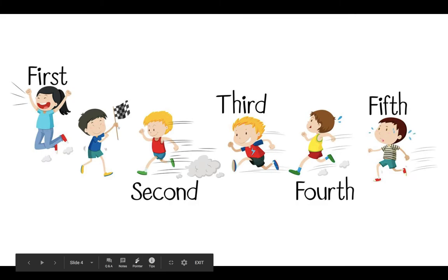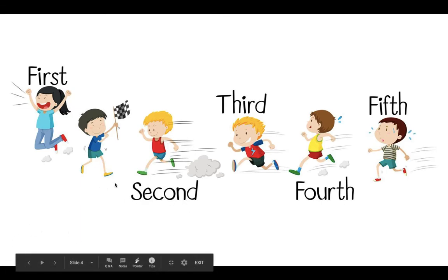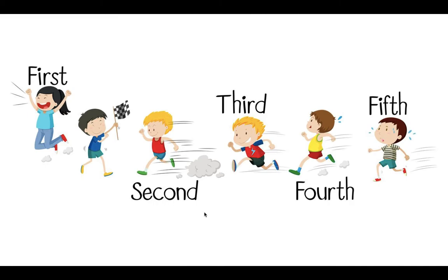I compared the HPLC to the finishing of a race. Initially, all the participants of the race are lined up, similar to the analyte in the HPLC. Once the pressure is increased or the race is started, the different molecules are separated based on their specific properties, similar to how in a race the athletes are separated based on their physical abilities. The physical abilities of the runners will result in which runner finishes first and which runner will finish last, similar to the specific polarity and molecular weights of the molecules, which determine which particles will be separated first.